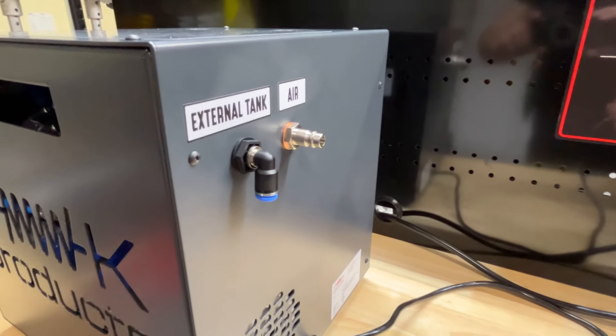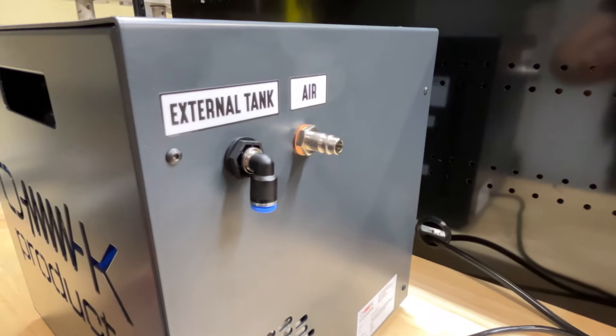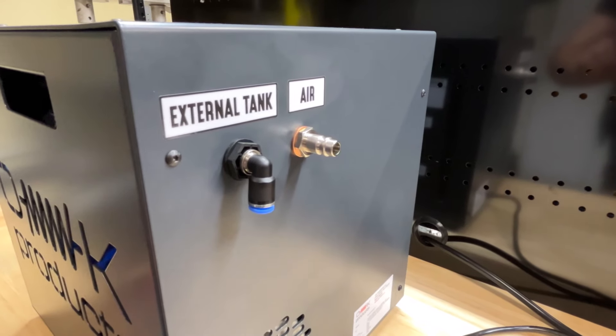So you don't have to worry about the pump getting damaged or any moisture in the air — it's all taken care of there.